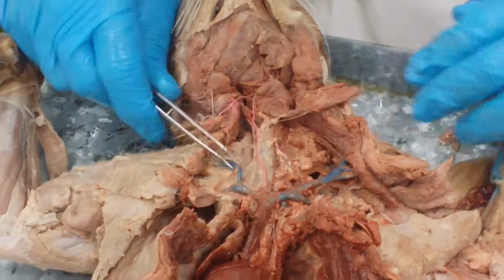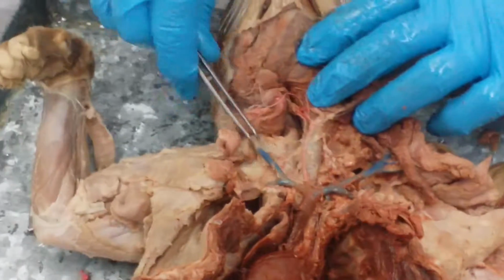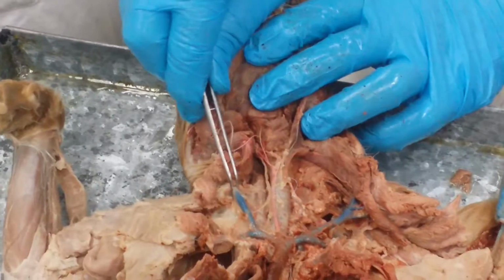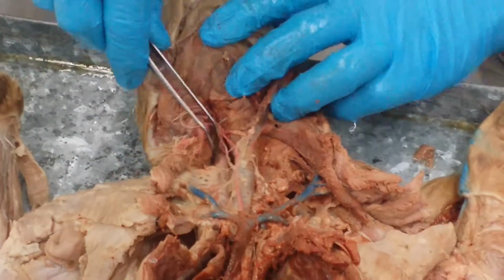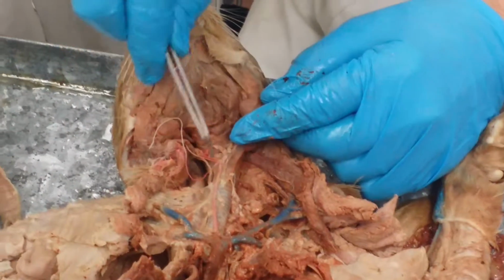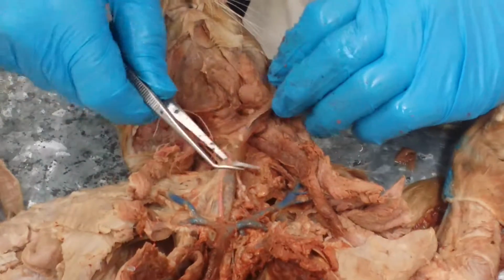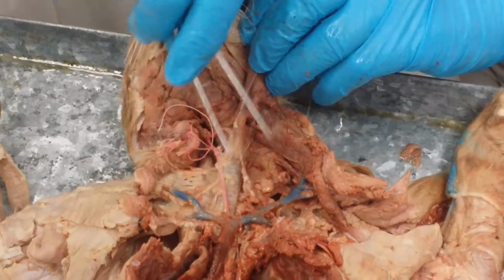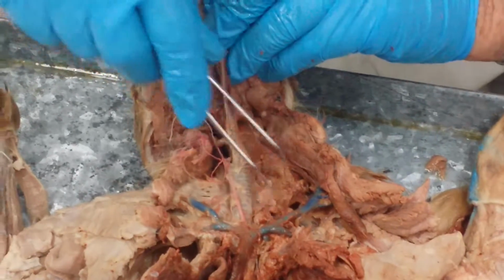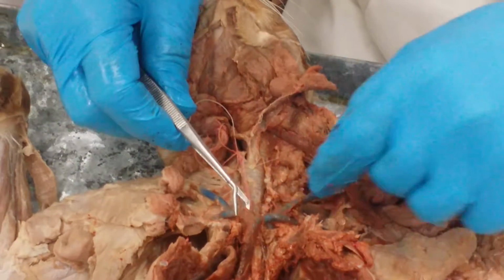Okay. Here we have this vessel, the external jugular. There is no internal jugular. I do see this is the right common carotid. The left common carotid is not here that I see.